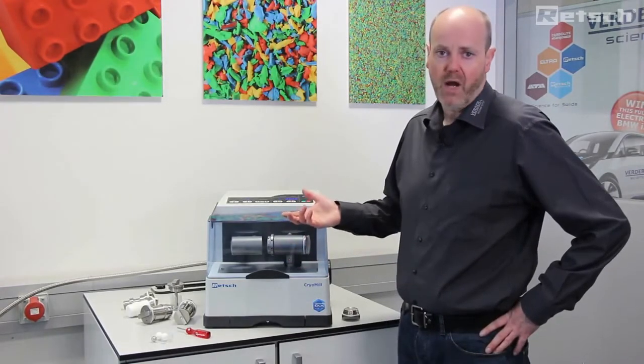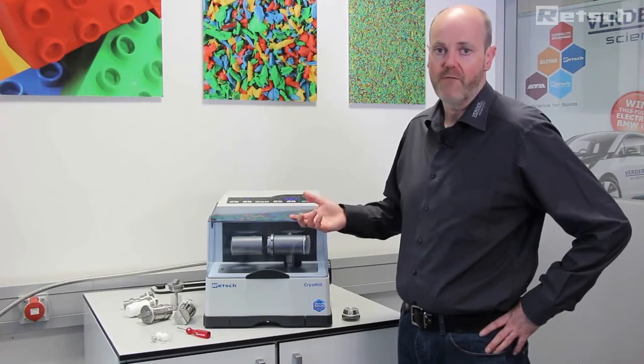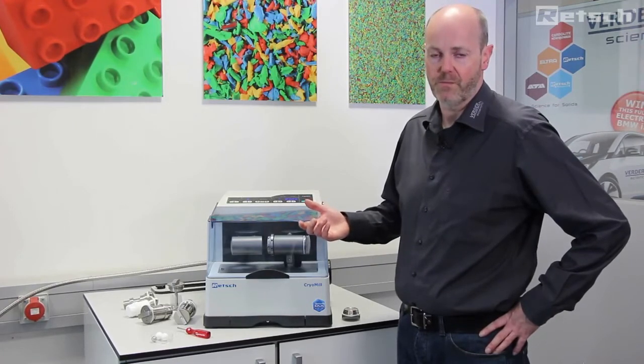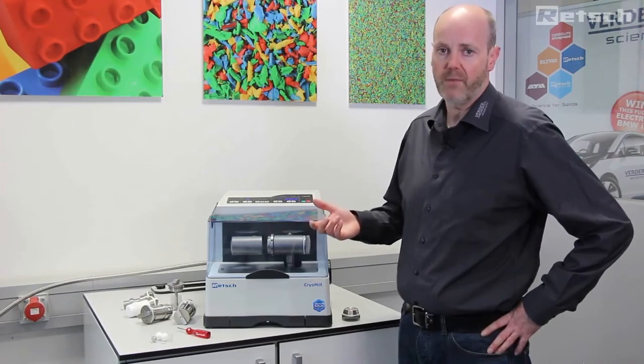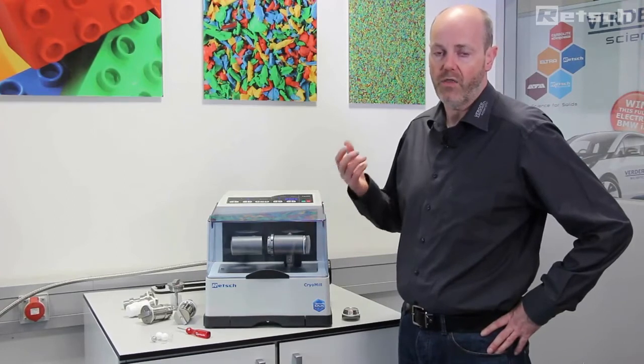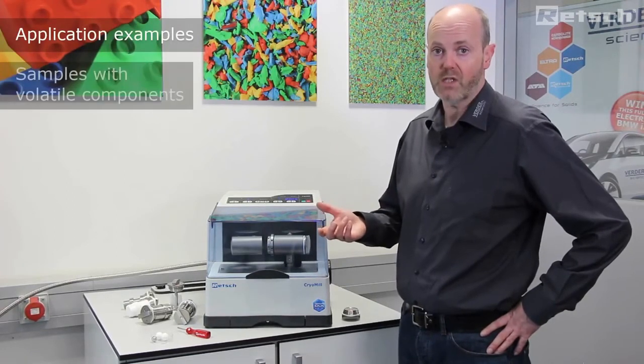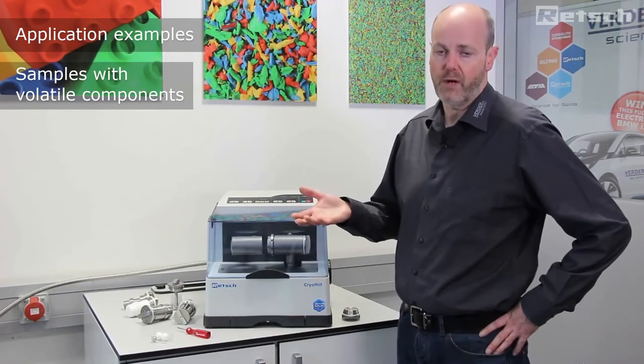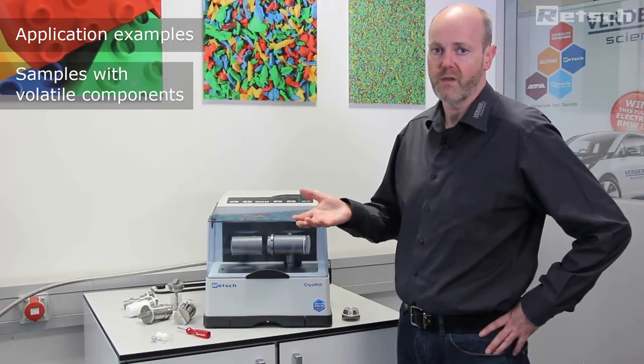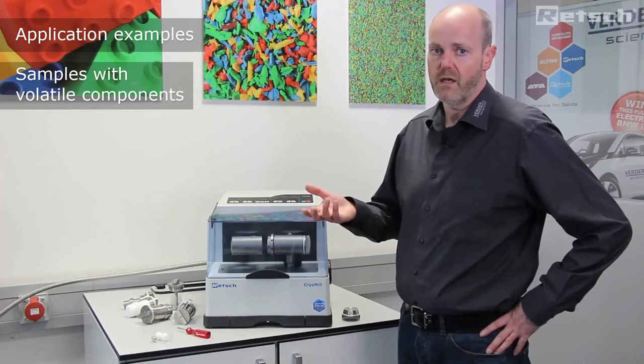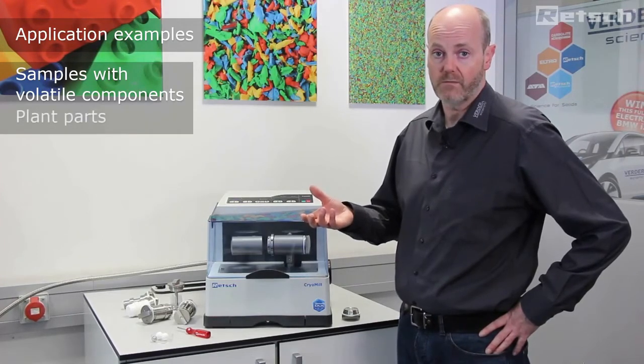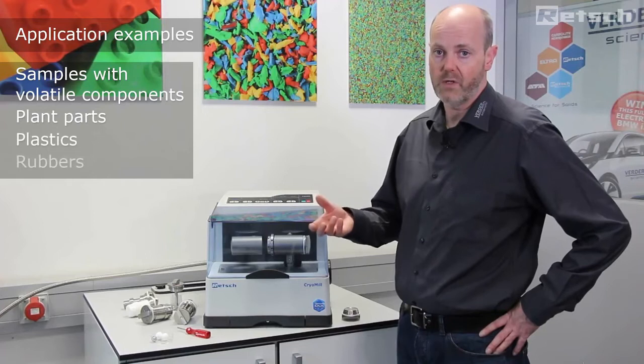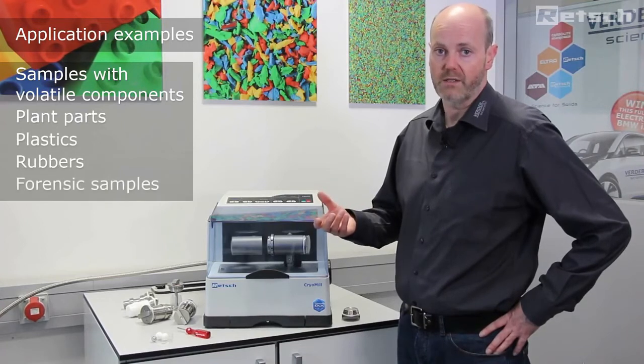Cryogenic preparation is commonly used in various areas of research. Common and typical application areas are those that want to preserve the volatile compounds that may be driven off during ambient preparation techniques, and these may include sample materials such as plant parts, plastics, rubbers, and forensic science.